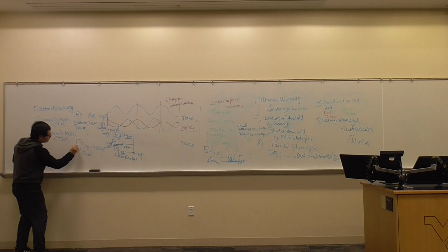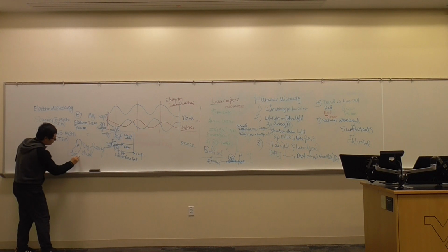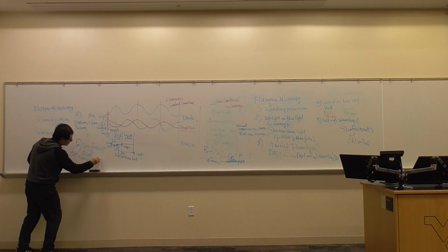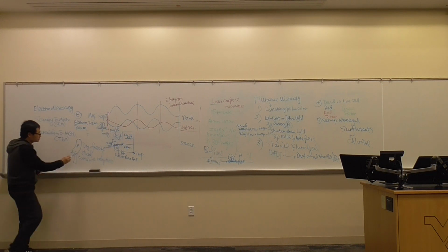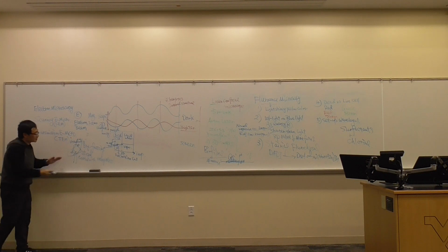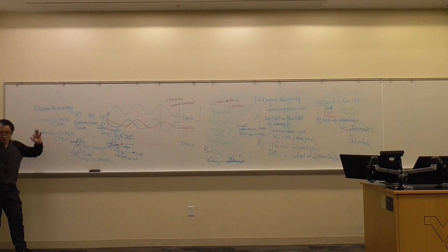And then you're going to see some structure like this, some structure like that, some like this. What do we do? We have to coat it with heavy metal. We don't say stain. Coat it with heavy metal. Then it will generate a large area, we call it shadowing. A large area. You can't see it, but those specimens will show up.